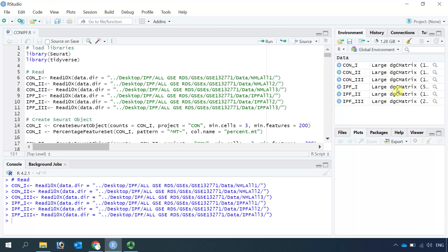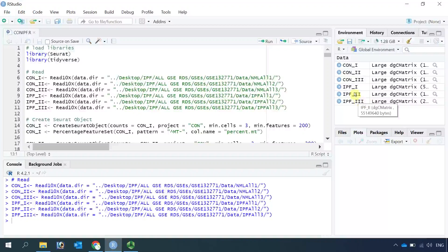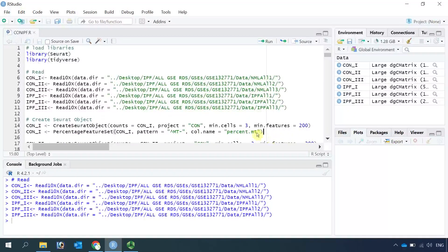You can see in this window we have six large DGC matrix datasets — three repeats of control and three repeats of IPF. Now we can convert them to Seurat objects using the CreateSeuratObject function. We keep genes that have expression in at least three cells and keep cells that have a minimum of 200 gene expressions. You can also see here we have the project name.